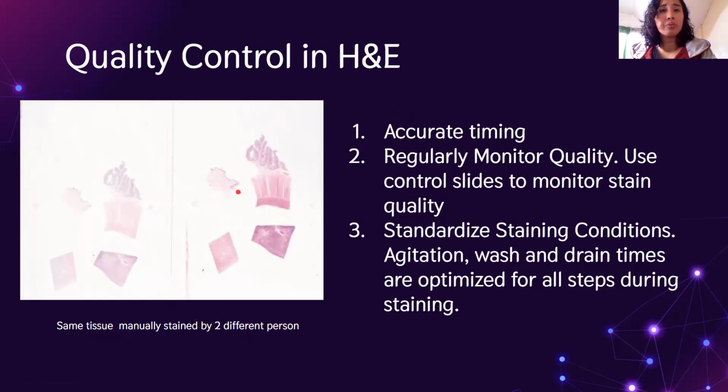So, magkaiba daw yung nag-stain dito manually. So, accurate daw dapat yung timing per stain. So, pag nagmamadali na, yan, standardize the staining condition, the agitation, the washing, and the draining. Dapat, consistent tong mga to. At mangyayari tong mga to, guys, kung automated yung stainer.